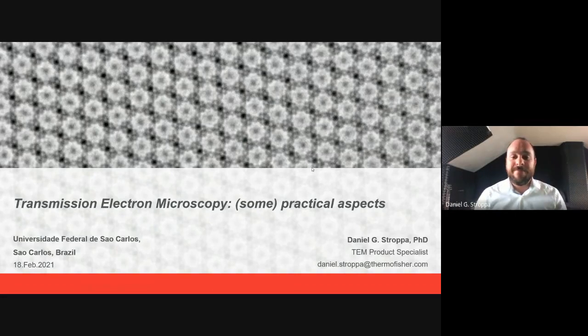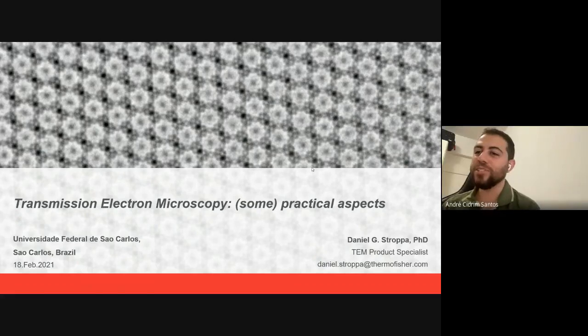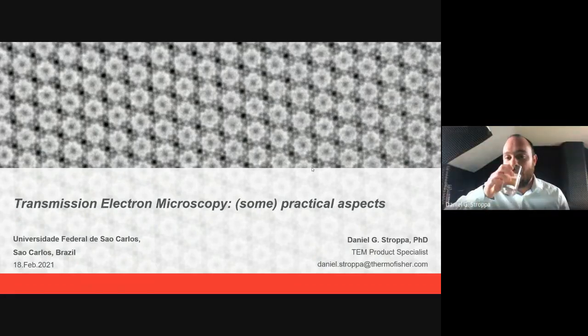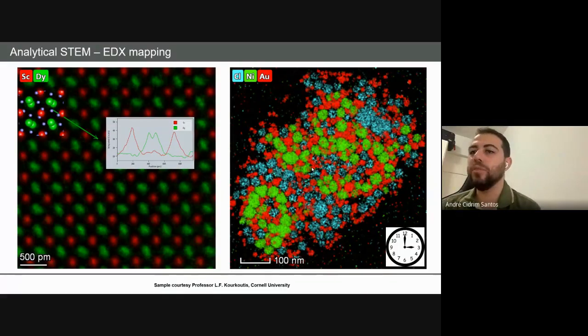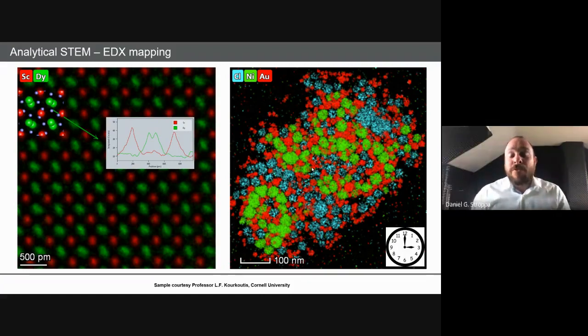So here, just to give you a typical timeline, a TEM image, when you do one shot, one projection, the typical duration of one image is 1 second. The fastest we can go would be 1 millisecond. Then STEM, a typical image takes about 20 seconds. A chemical map will take a minute or so. Okay, that's a lifetime. Yeah.